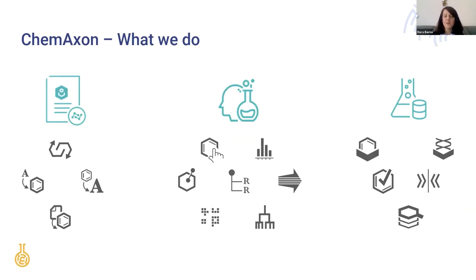data in various scenarios. So the first, larger part of our tools can be used in those cases when someone has to extract any kind of chemical data from different sources. And these different sources can be, for example, a database or some legacy documents, scientific papers, articles, or patent documents, just to name a few. And the same set of toolkits can also be used besides this data extraction to convert between different chemical file formats.